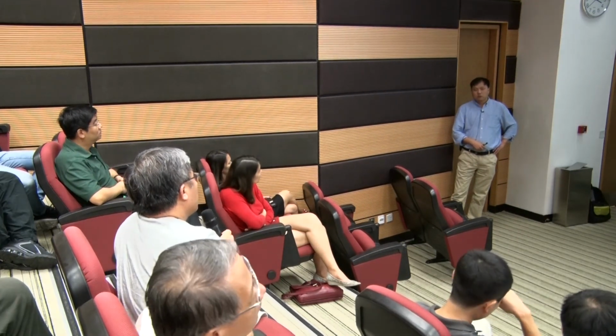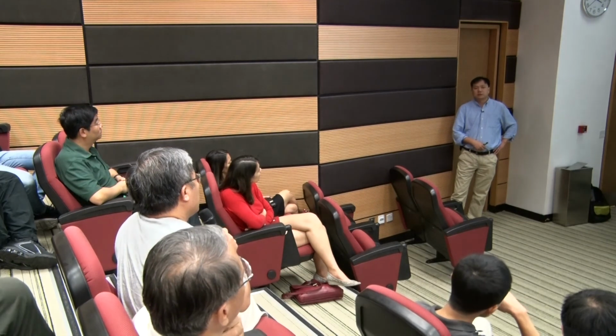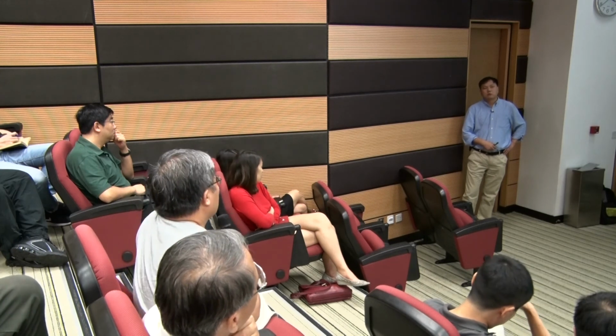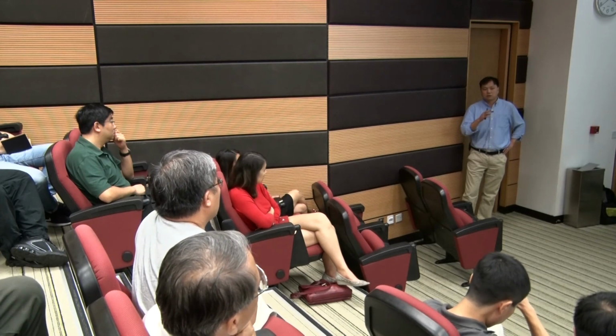So what is the smallest protein that Cryo-EM can comfortably work with right now? Comfortably work with, I would say probably 100 to 150 kilodalton. But there are already reports in the literature where people got, I think, a 6 or 7 angstrom structure from a 60 kilodalton protein. Okay, so in principle we can work with very small proteins.